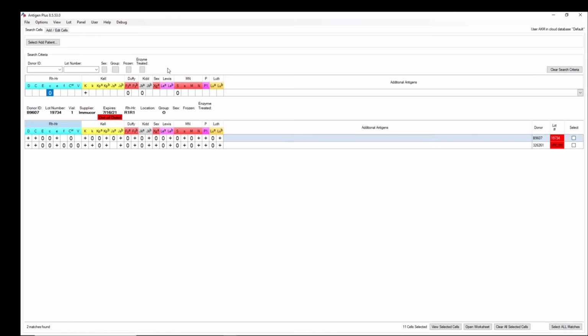Any questions at any time if I'm going too fast? Yes, I have a question. Okay. I wasn't here in the beginning, but is this just like an initial setup of the software, or what are we doing? No, exactly, this has to do with understanding how it's working in the lab. The settings are just, I'm telling you about the settings because they're the context in which you'll be working, and you have some options there. I'm going over them rather quickly. It's all in the documentation, so you can look at those. But I'll try to get down into more of the nitty gritty for the work on the bench.